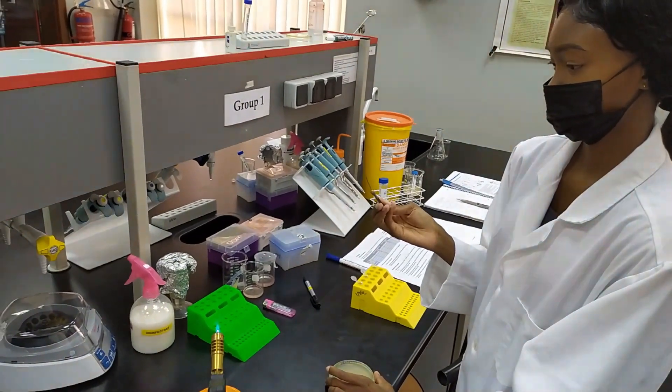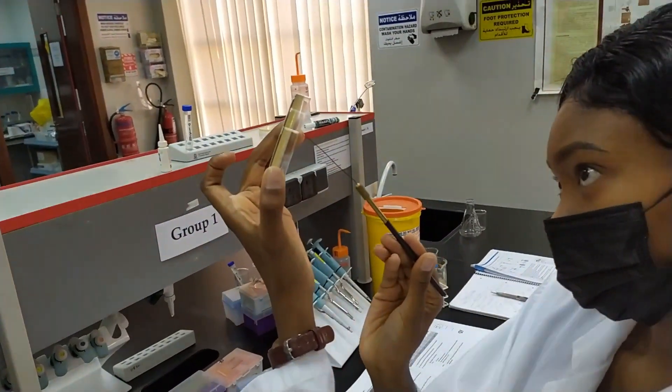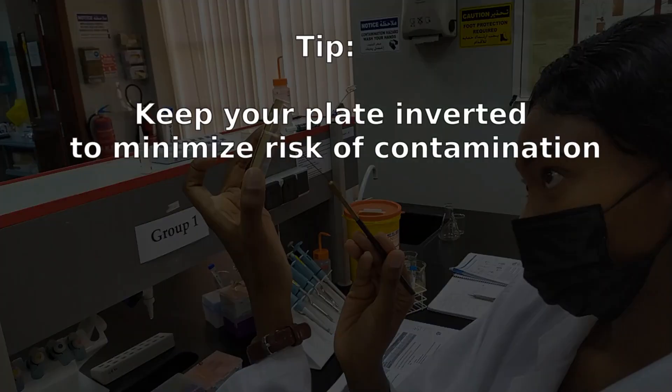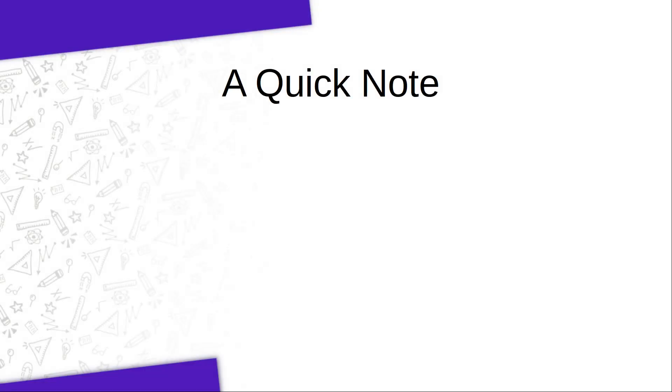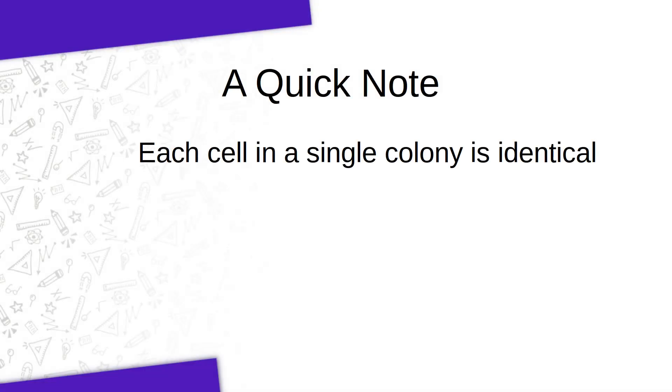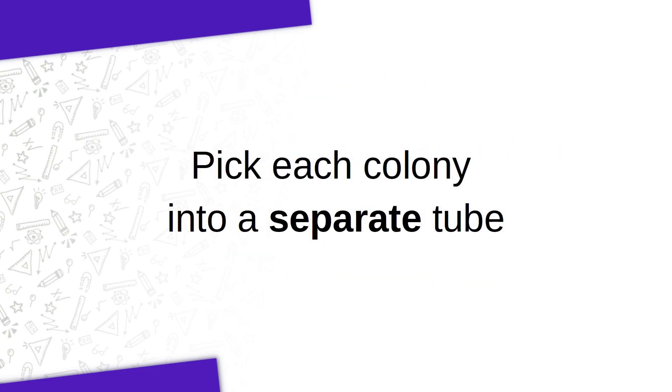In this case here, Okonya is going to be picking a colony from her plate. I'd like to point out the way that she's holding the plate — she's going to keep it upside down for the most part. In this way, she's minimizing the risk that the plate might get contaminated with something in the air. One colony is basically a cluster of millions of cells, and all of those cells are exact duplicates of one cell that was put on there originally, which means all the cells in that one colony have the exact same plasmid. When you are picking your colonies, make sure that you pick only a single colony at a time. Then sterilize your loop again and pick a second colony and put that into a separate tube. Do not mix your colonies together.